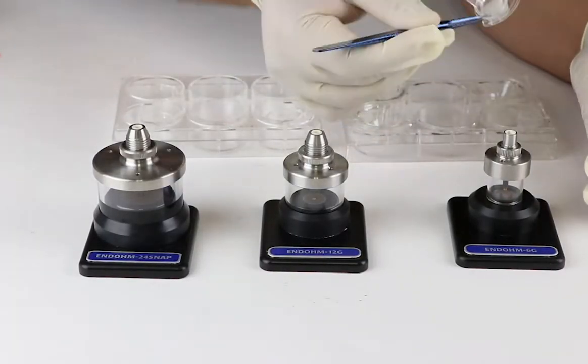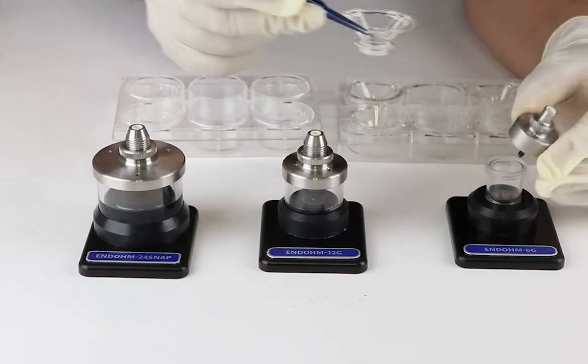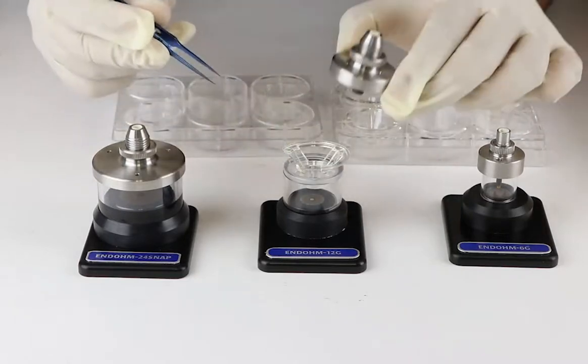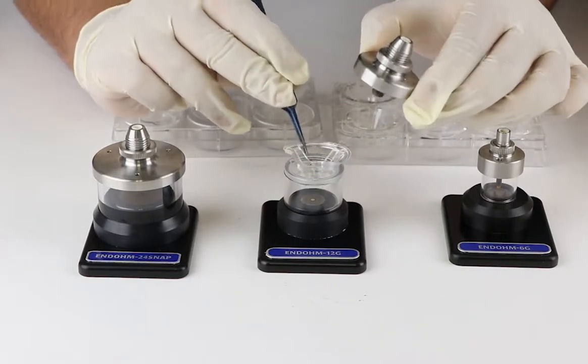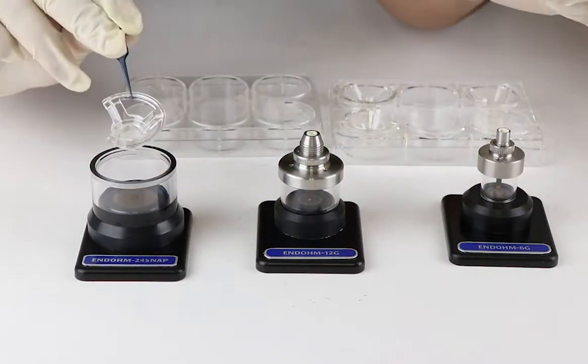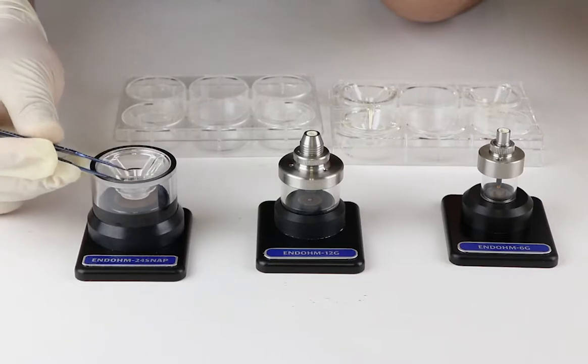The EndOhm chamber and top electrode have specific dimensions. Therefore, a specific EndOhm type is compatible for 6, 12, or 24 well plate inserts. For example, if you try to use a 6 well plate insert with an EndOhm 6G or EndOhm 12G, it is not going to fit into the chamber.